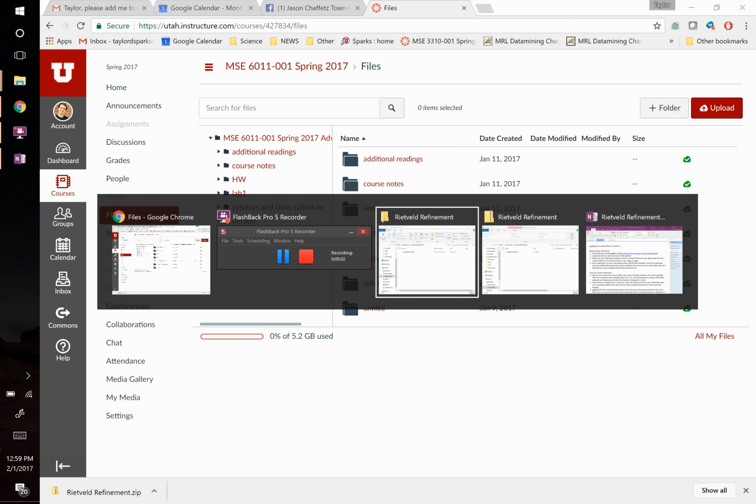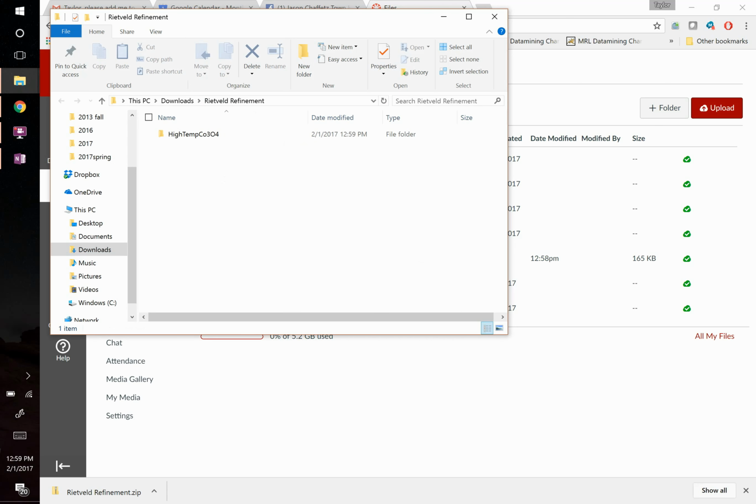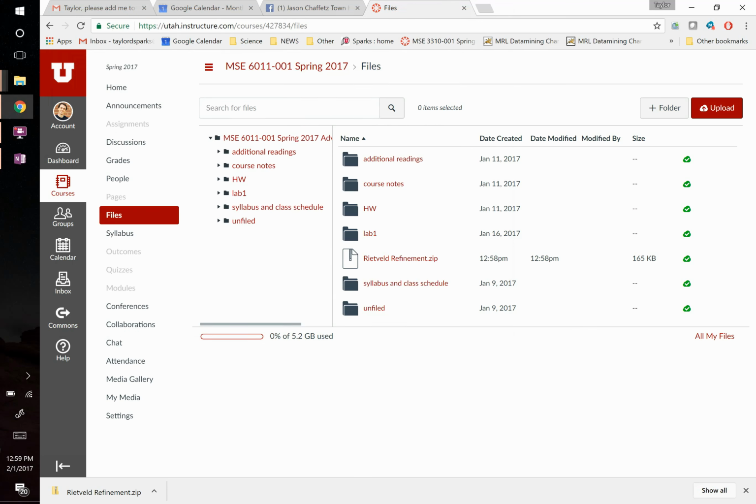Okay, so I'm going to go over GSAS-II, pyGSAS. If you have that downloaded and you want to follow along, great. Otherwise, you should be able to follow these steps, no problem. I've given the steps on how to do it.